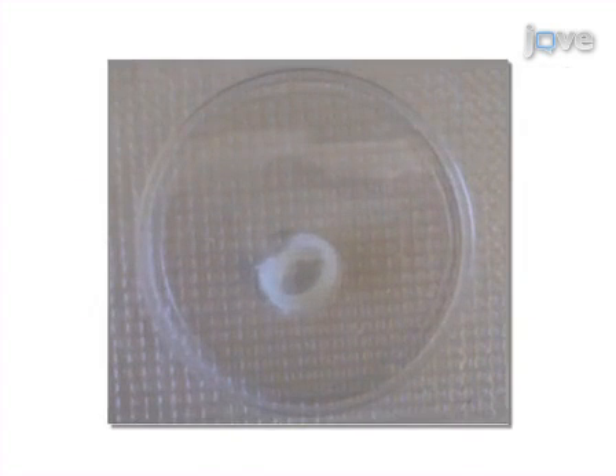In the reactor, the cells grow into vessels that pass immunochemical, biochemical, and mechanical tests. The implications of this technique extend towards therapy of coronary artery disease, because this technique is a promising approach to regenerate implantable small diameter vascular grafts for arterial bypass.